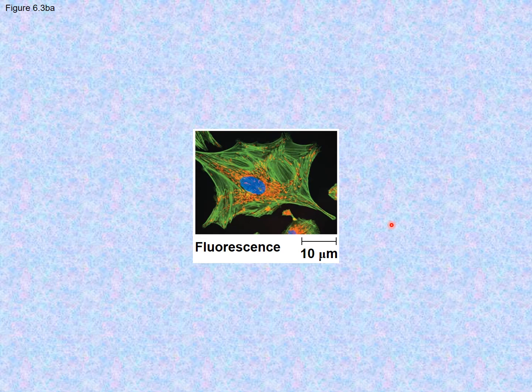This is fluorescence microscopy. And this kind of shows a representative example of fluorescence microscopy. However, we're going to see some other examples, although this may actually be because it's pretty clear. However, the point of fluorescence microscopy is to allow us to actually label molecules that are inside the cell with different colors, right? Really, they're just labeled with a molecule that fluoresces under UV light, which is the source of light in these types of microscopes, a specific color.